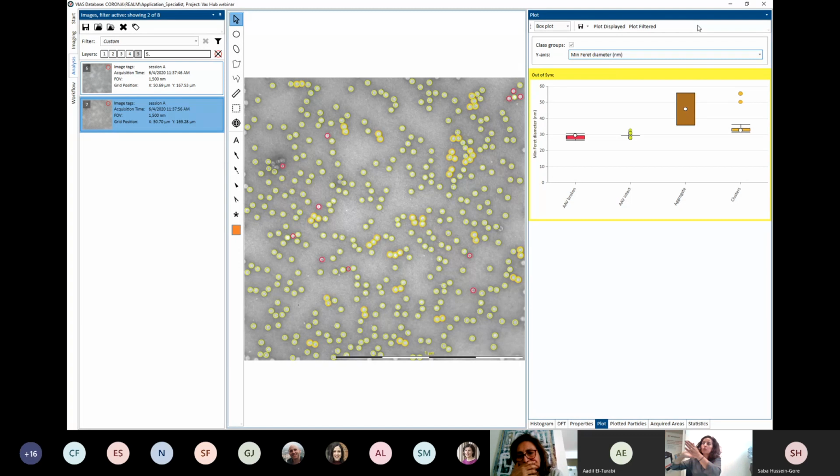And I would maybe say that you would want to do it in VIA so that you can click on those specific ones in the graph and really look at what is happening. Is it an artifact, or is it actually a subpopulation of something? Is it that you're seeing different serotypes mixed together, or different clades doing different things? Or is it that some of these are stuck together, and this coming together as duplets or triplets is significant enough that it will provide you with a second bump or something?